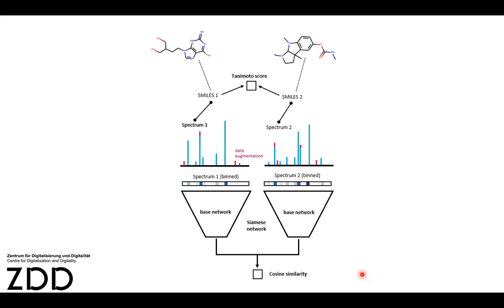This means that we have two spectra, and we know ideally what the Tanimoto score between these two spectra is. Now we ask the network, please predict the score for them. And this is how it learns. Whoever is not into machine learning, be skeptical about anything with the word intelligence or learning in it. It doesn't have anything to do with what humans learn, but it's optimizing statistical functions towards seeing a lot of data and trying to be as close as possible to the original score, if it manages to find patterns.